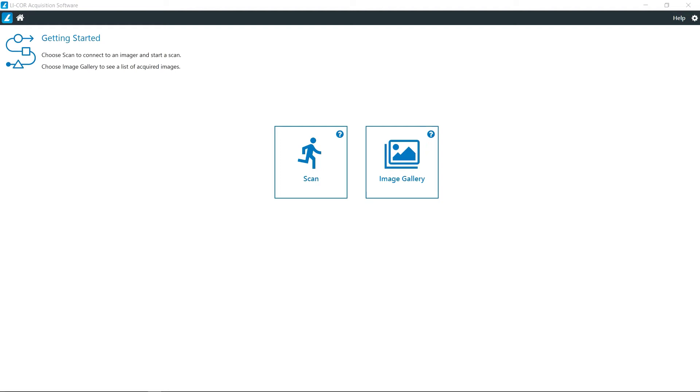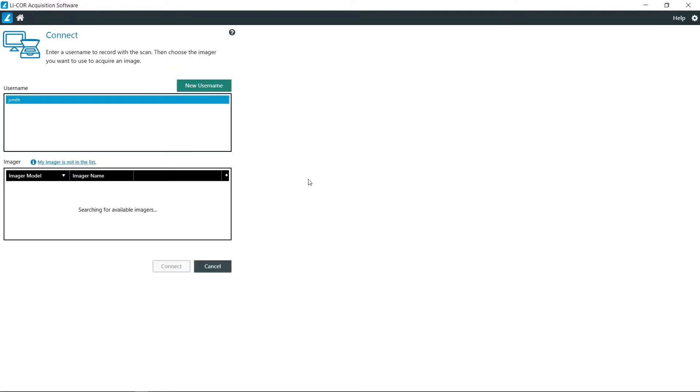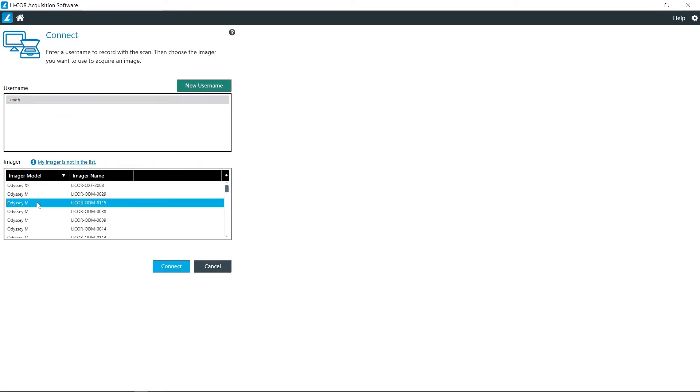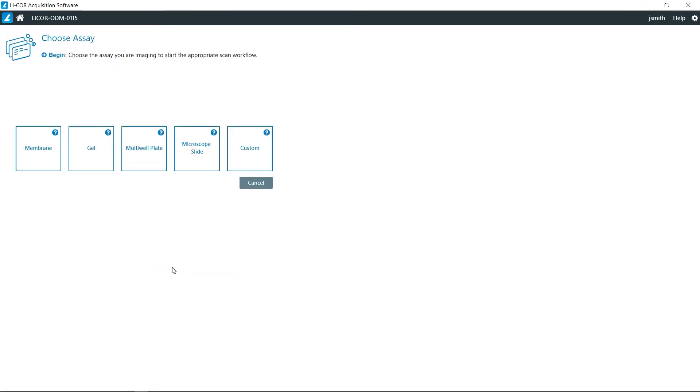In this video I will be showing you the steps involved with doing membrane acquisition on the Odyssey M. With the acquisition software open, click on start scan, choose your username and then the instrument you want to connect to. Most of the time this will just be a single instrument, then click connect.